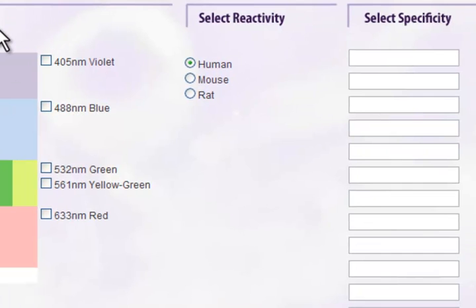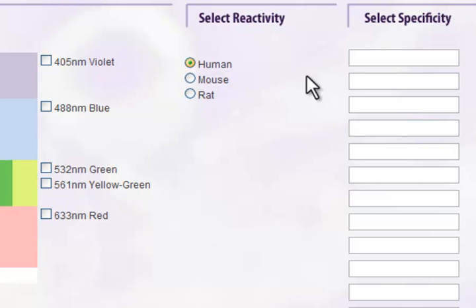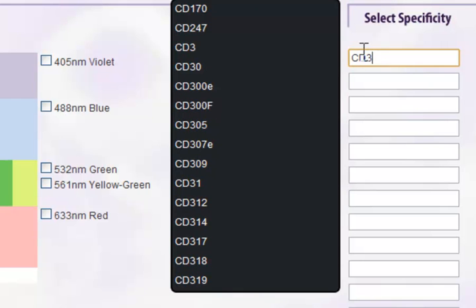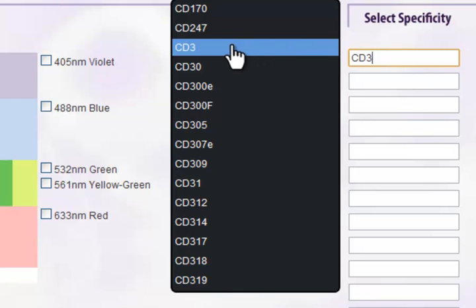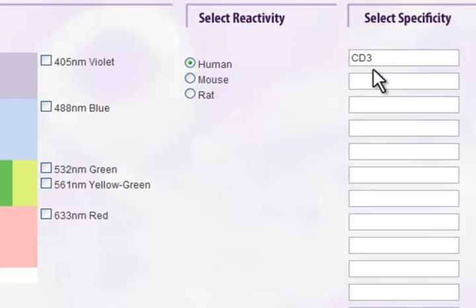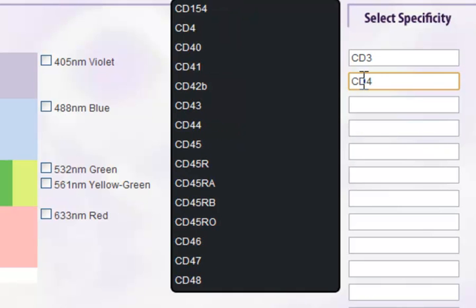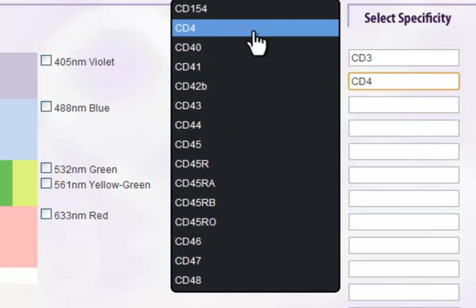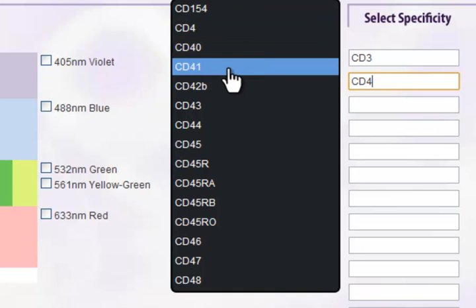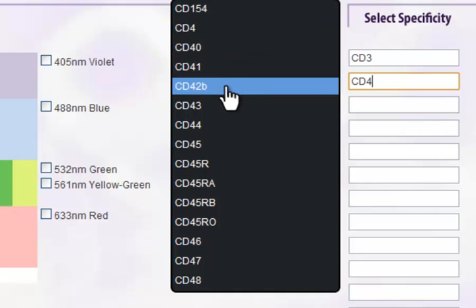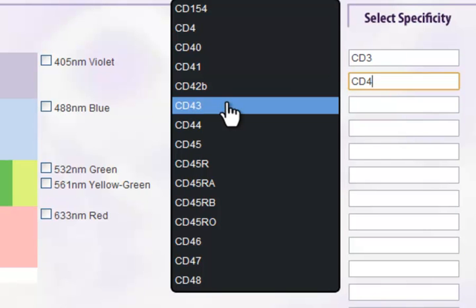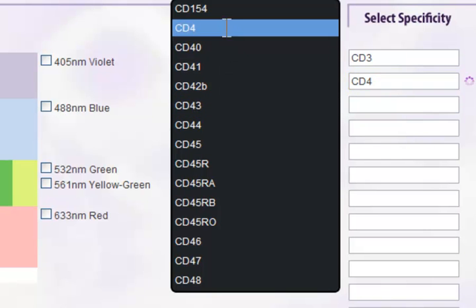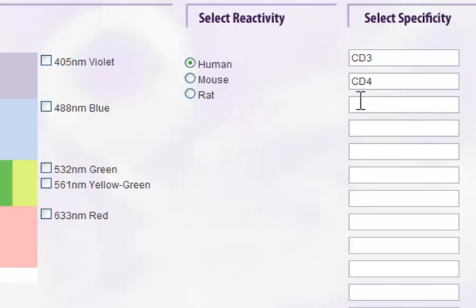Next, select your reactivity or the type of sample you will be analyzing. Then type in your specificities. In this field, as you type, a window will pop up displaying the matching specificities in our catalog. You are required to select an item from this window. Otherwise, it may not match products correctly. To help you, the window will display synonyms for specificities as you mouse over each item. Click to select your desired item.